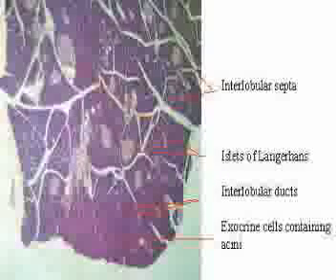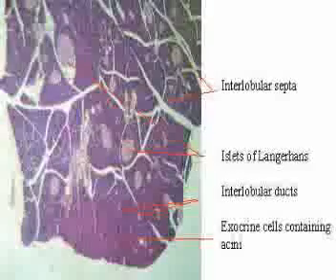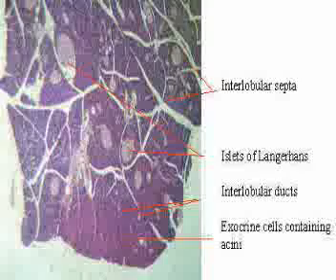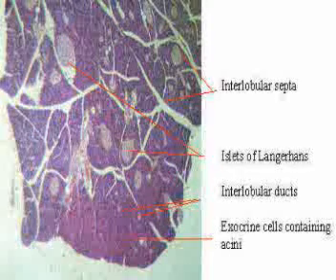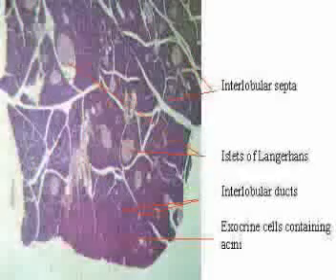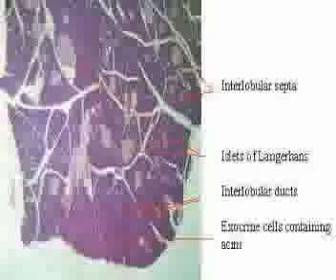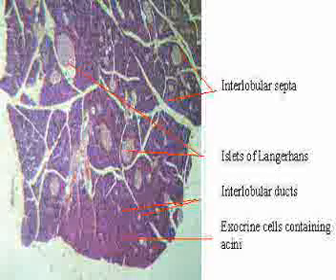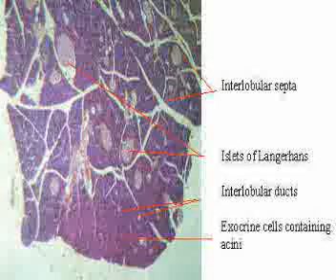The pancreas is easily recognized by its many ducts and septa, including the acini, which are the basic functional exocrine unit of this organ. The islets of Langerhans are the basic units of the endocrine part of the organ, and they are prominent features which may be confused with the glomeruli of the kidney, but which can be easily distinguished by the numerous tubules in the kidney. Differential diagnosis.